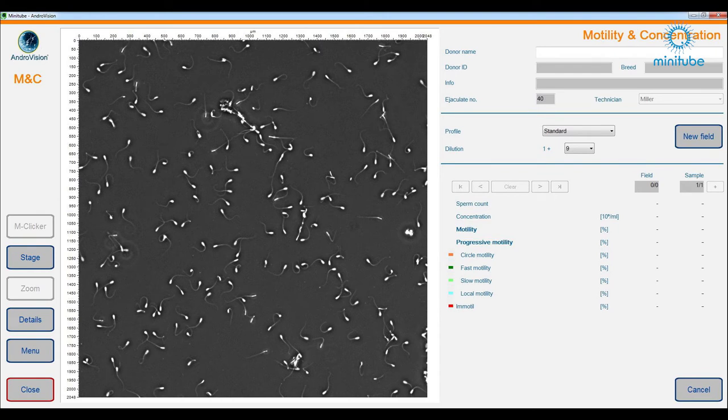This is how an optimal microscopic picture should look like. All semen cells appear fully white on a black background and the light is distributed evenly on the picture.